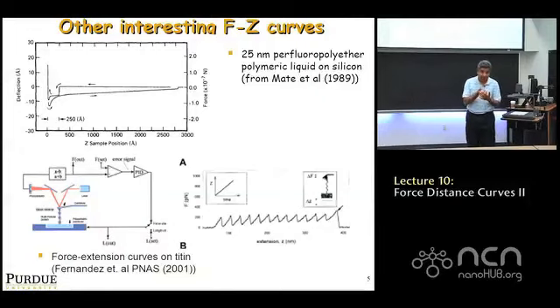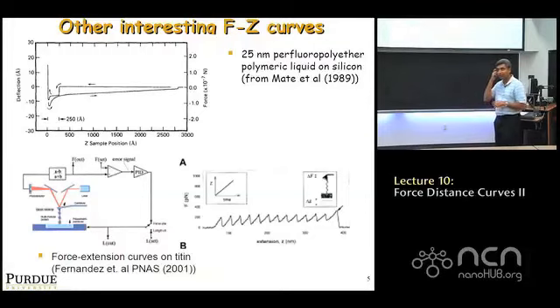So you go to the situation. So there are two surfaces happening here, really. One is the surface between the liquid and the silicon, which behaves more like the infinitely stiff surface with attractive forces that I showed you, that it snaps in and pulls away. And then there's a second interface, which is the liquid-air interface, where it behaves more like the meniscus example that I showed you before. So you put the whole thing together and it becomes obvious what's happening. But it's pretty cool. You can start really understanding the physics of what's going on very nicely.